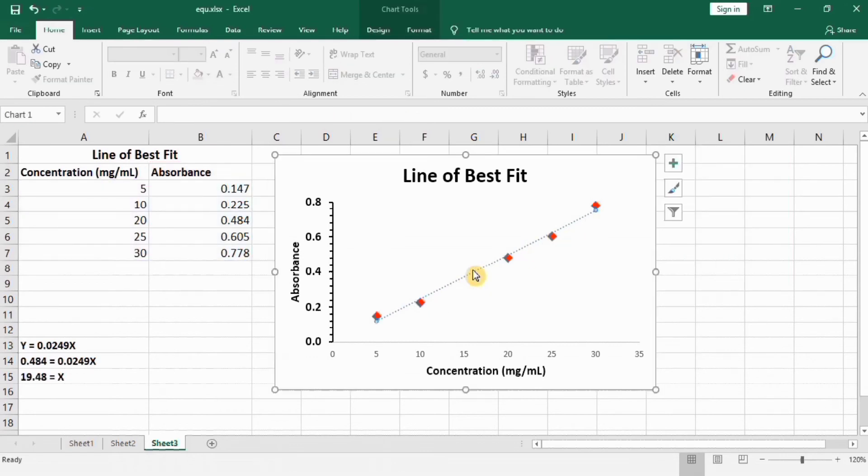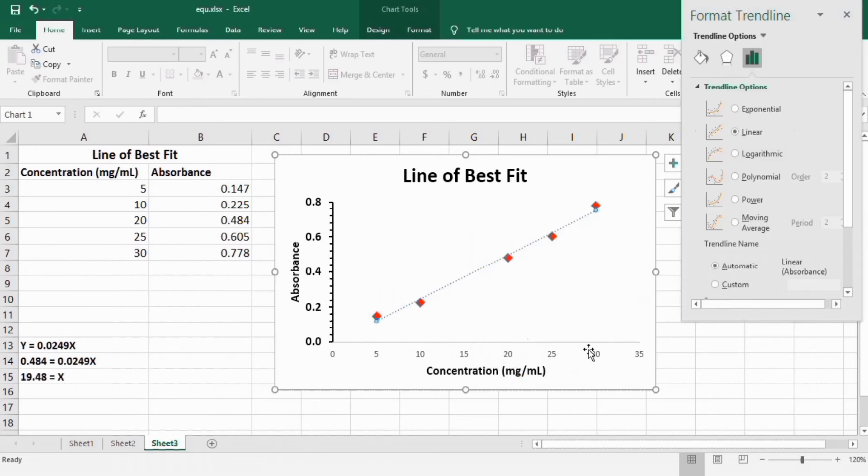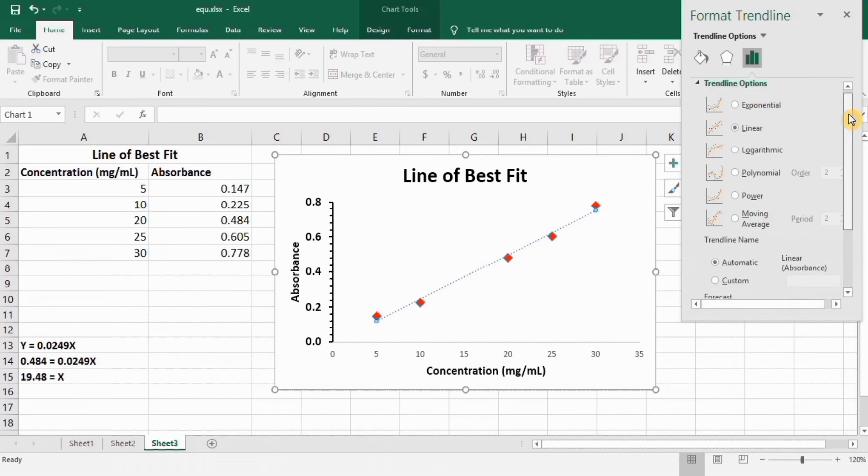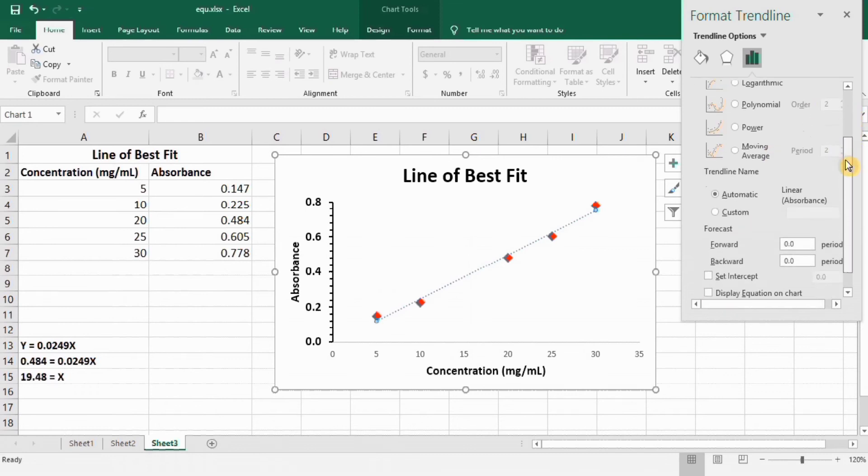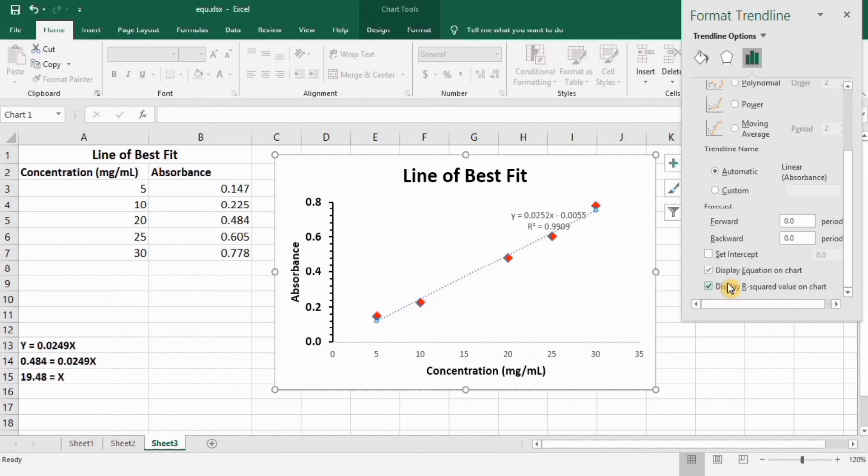Right click, go to format trend line. Different options appeared. Scroll down and from here you can check the option of display equation on chart. And I will also check this one, display R square value.